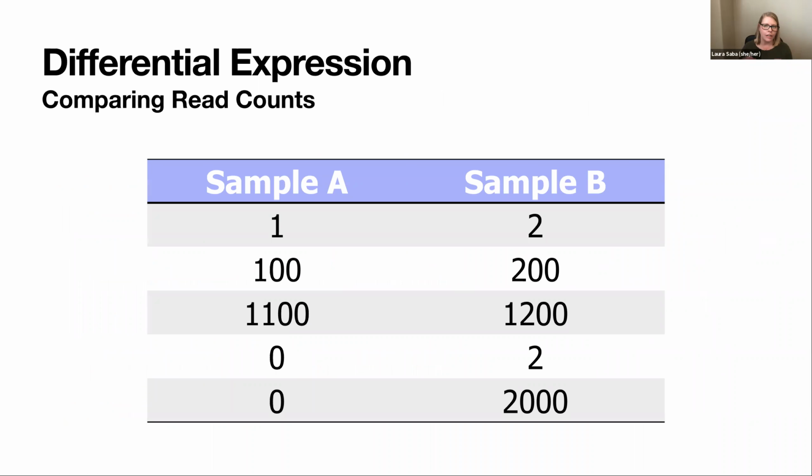So finally, getting you into the framework of what's the appropriate statistical model for differential expression, I wanted to show you these 2 samples across a couple different scenarios to get your intuition and your instinct going.